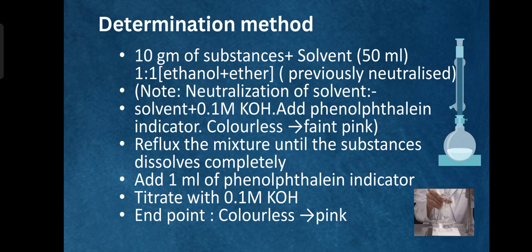As we further go on titrating with the potassium hydroxide, a point comes where the solvent containing traces of free acids gets neutralized, which is indicated by the pink color. Once it gets converted into the pink color, the solvent is considered completely neutralized and is ready for the further step.